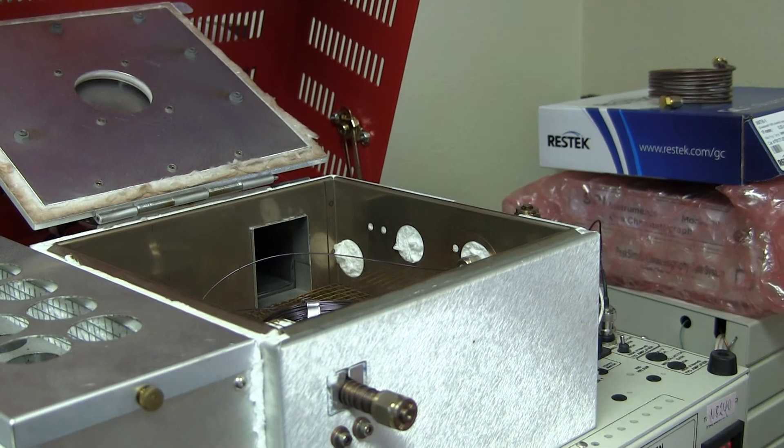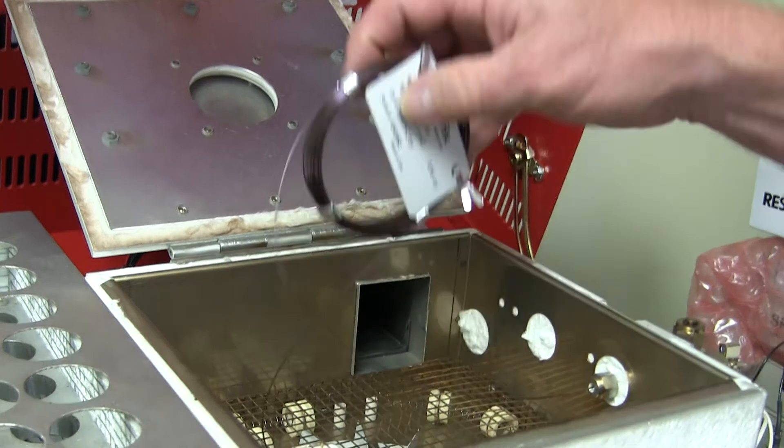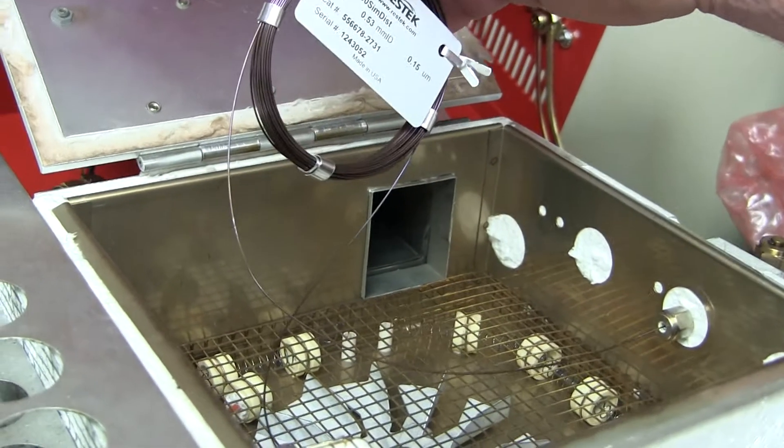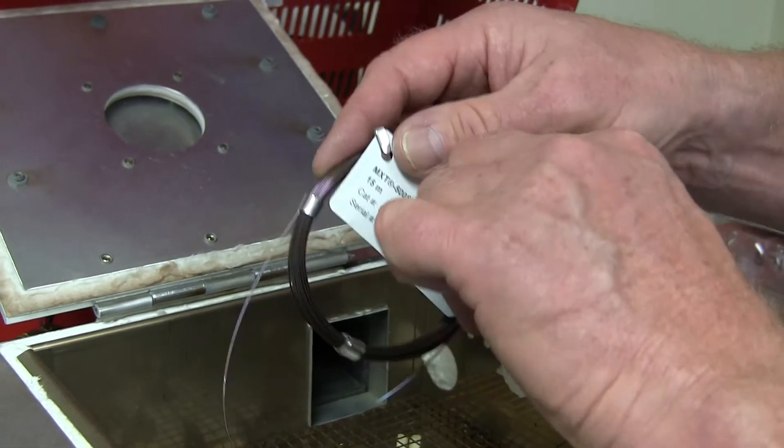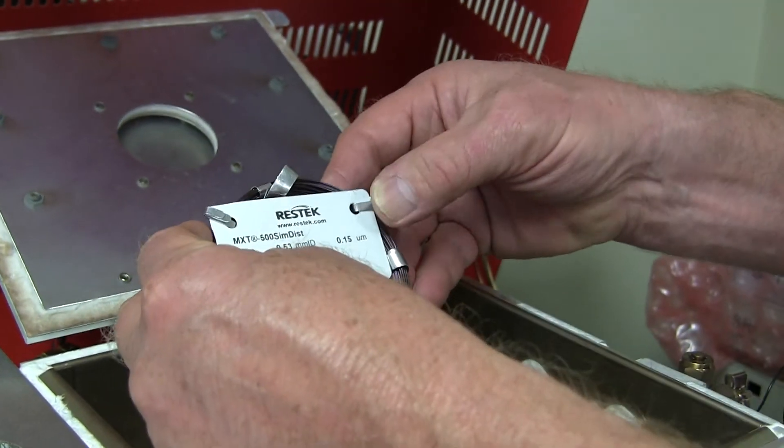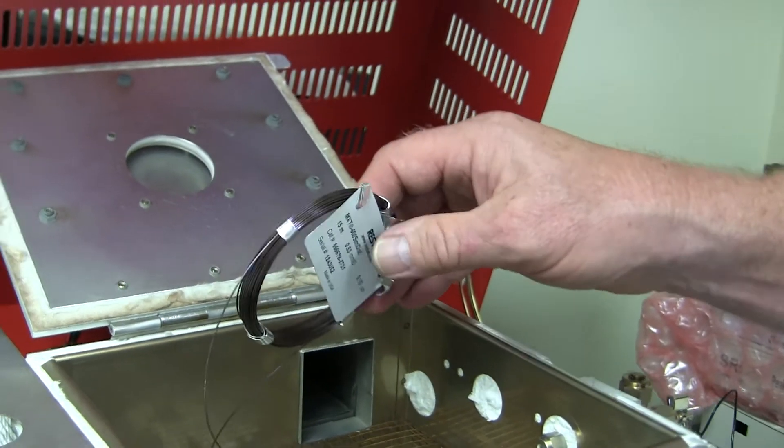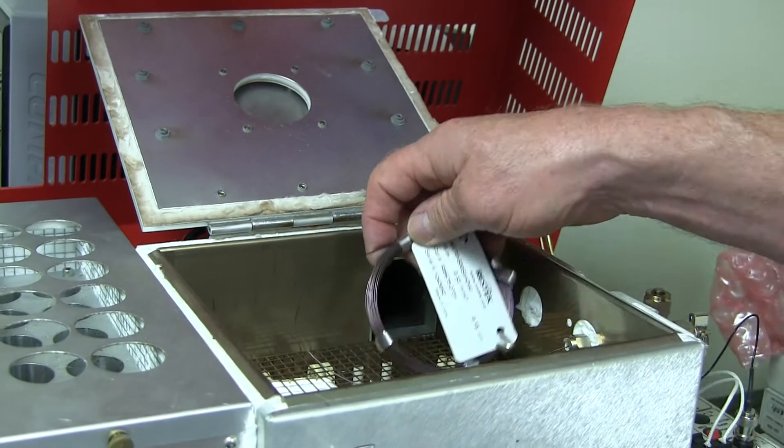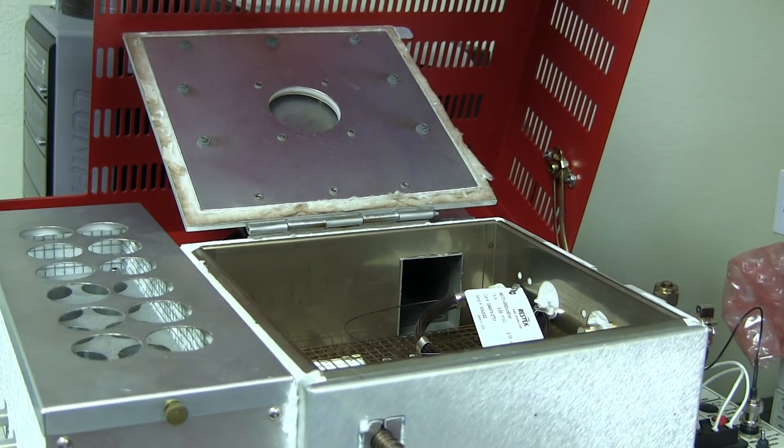Another meaning of the word bake out is to bake out the column itself. This is a capillary column that has a temperature limit of over 400 degrees. If we were baking this kind of column out, this is a Restek MXT 500. It's meant to be a very high temperature column, so it's easy to bake this one out at 400 degrees or 350 or whatever you think is safe.